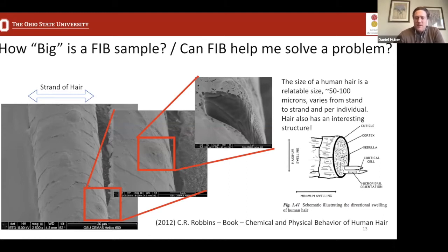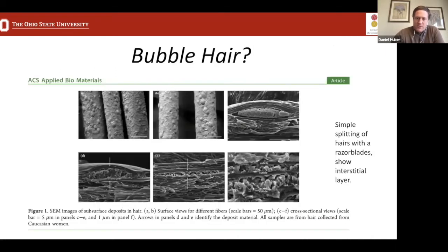There's basically calcium fatty acid that was forming underneath the layer of the hair. If you think about a hair, the structure of it is a little bit like a tree trunk, where you've got the cortex and the cortical materials. It's kind of like the wood inside of a tree, and then you get this outer structure, the cuticle. It's a little bit like the tree bark. And so the problem was there's these little bubbles that were forming between the tree trunk and the bark.